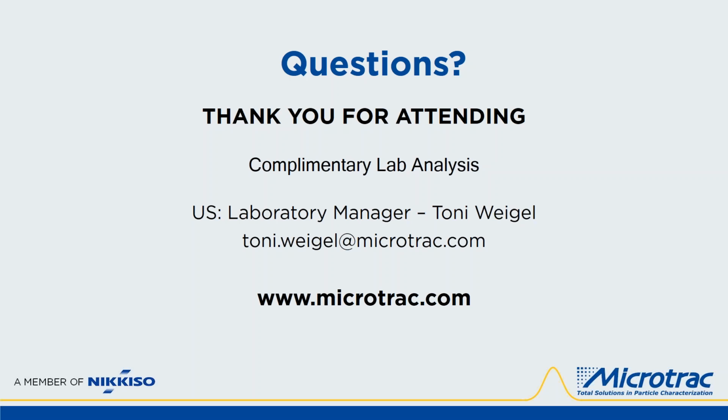If an instrument would need to be recalibrated, and we don't anticipate that it really ever would, unless it falls on the floor or something, and some of the optics or the array detector alignments got damaged somehow. But if somebody would ever want a recalibration, we can make a service call.